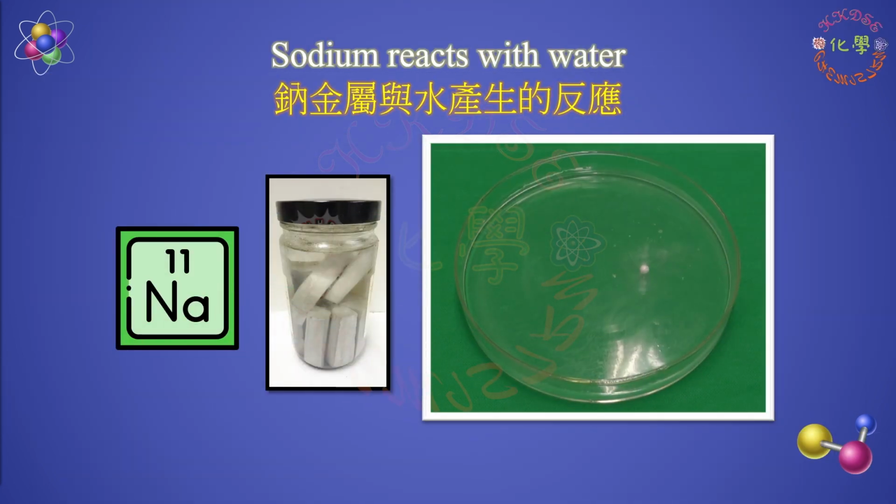Put a small amount of sodium into a bath filled with water. Sodium and water react explosively. It produces the alkali sodium hydroxide and hydrogen gas.